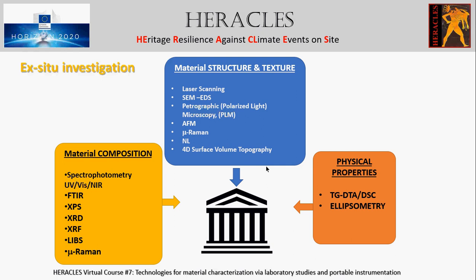This technique is complementary with X-ray fluorescence and LIBS. Individual mineral grains from a rock sample may also be analyzed by XRD when optical means are insufficient. The technique is destructive, as most mineralogical cultural heritage samples have to be sacrificed.